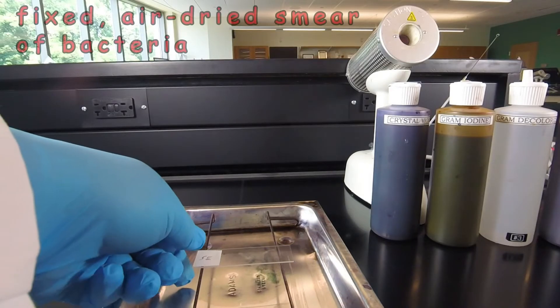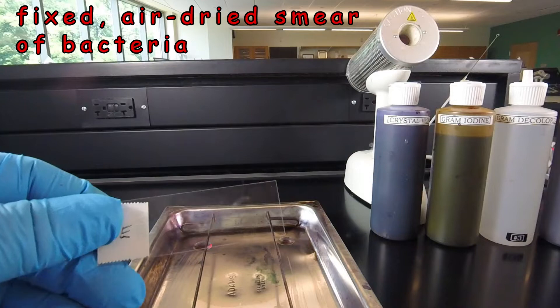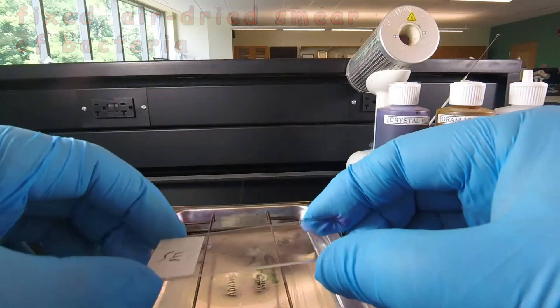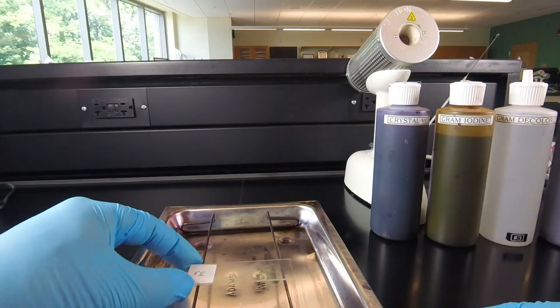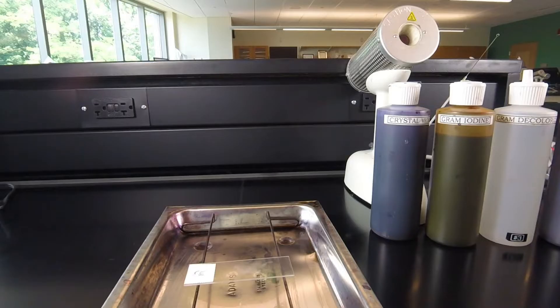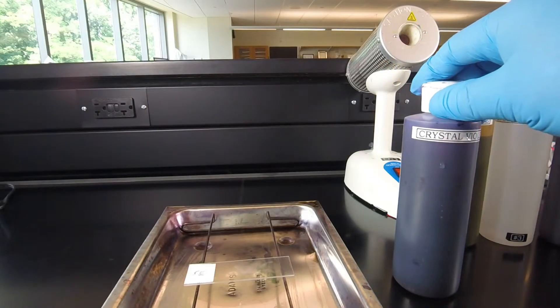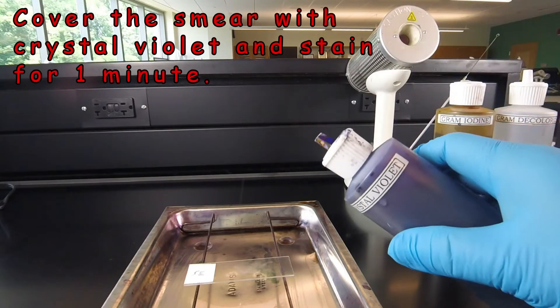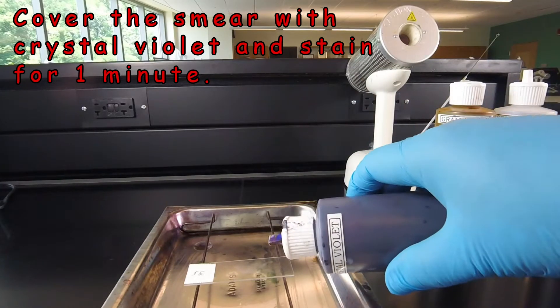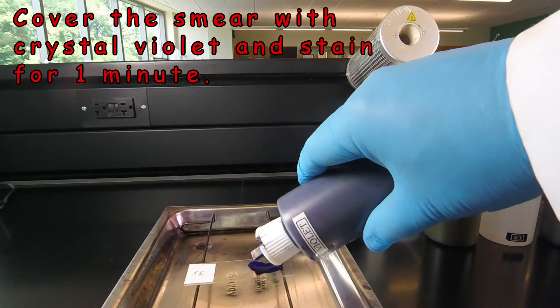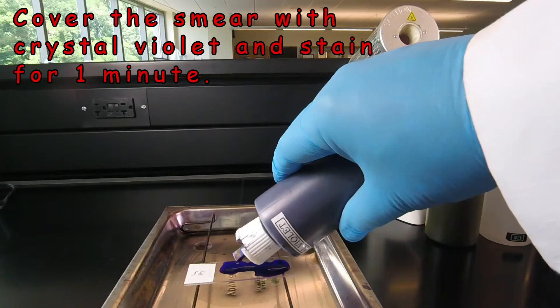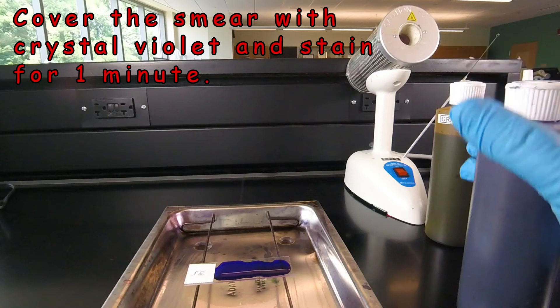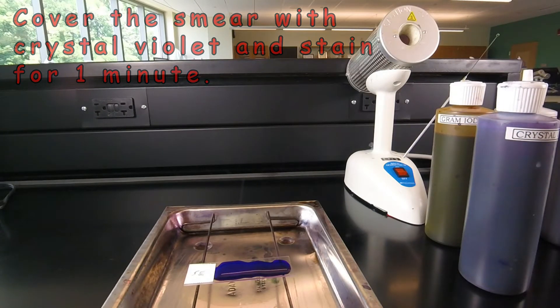We have an air-dried smear of bacteria that we've prepared according to the instructions we learned in a previous video lesson, and we're ready to start doing the Gram stain. The first step in the Gram stain is to stain the bacteria with a basic dye crystal violet. We open up the bottle and add enough crystal violet to cover a good part of the smear, and we let that sit for one minute.